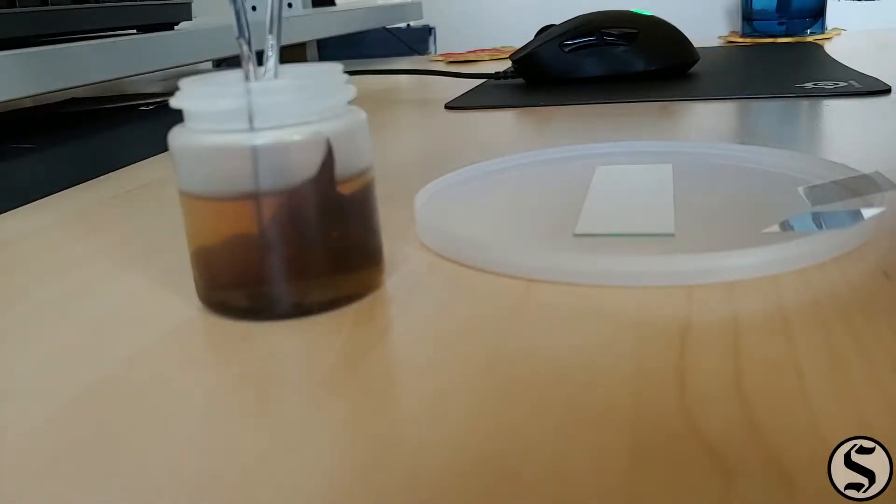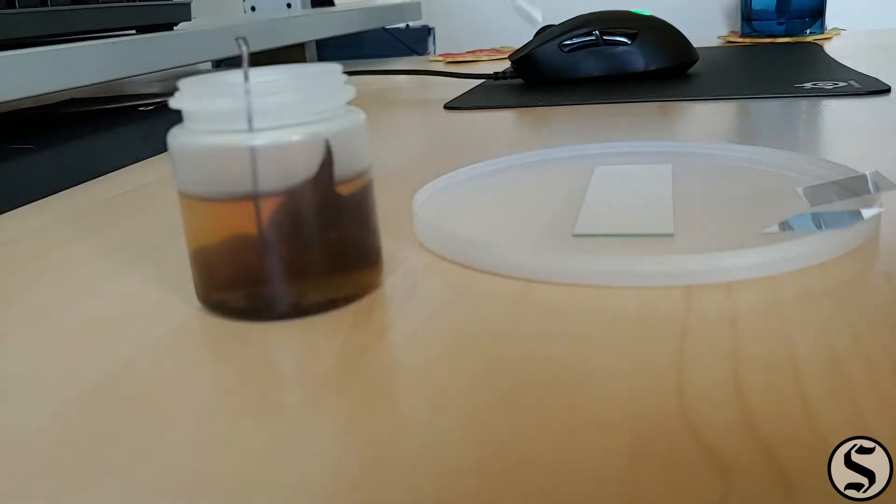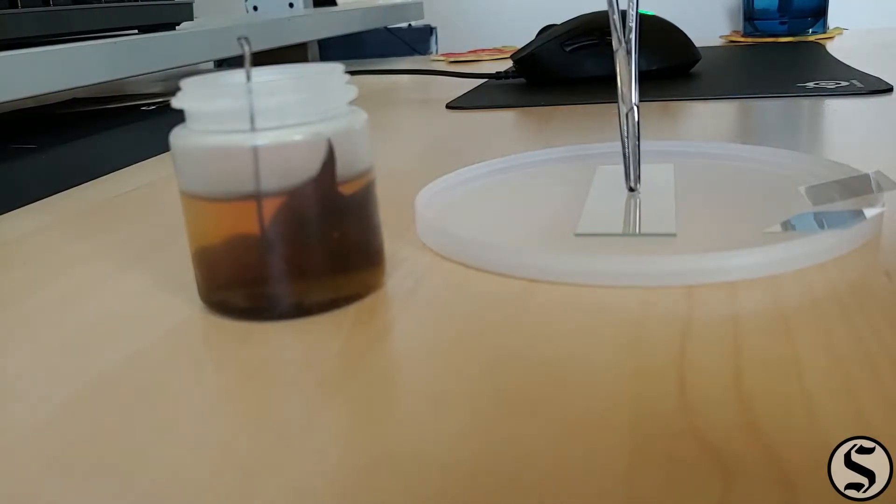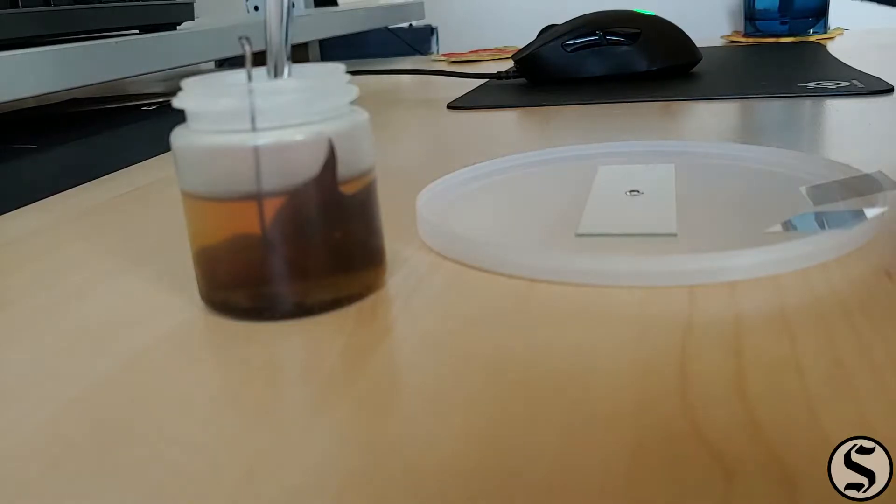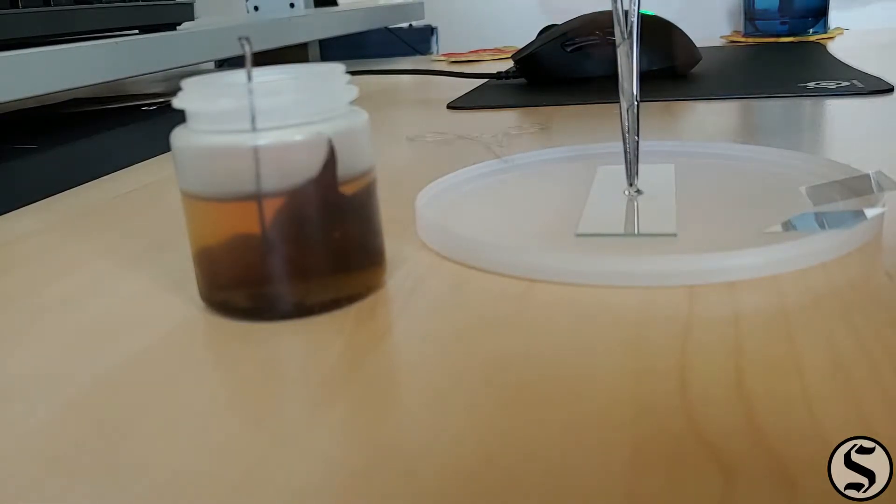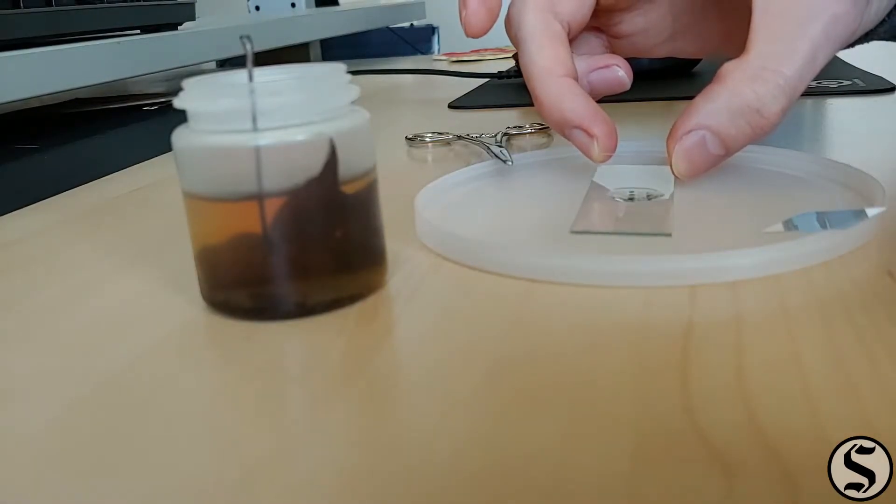I just thought that first birdbath was so interesting that I had to check out another one. As with last time, I made sure to get plenty of sediment in my collection and to get some of that sediment on the slide for us to investigate. Let's check it out.